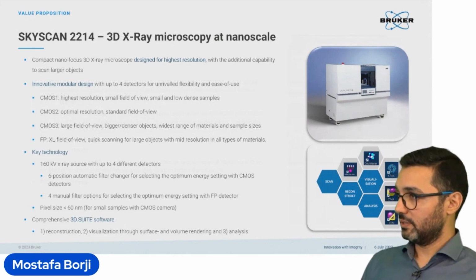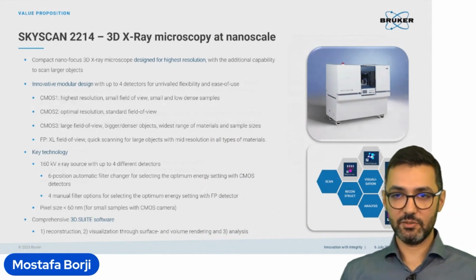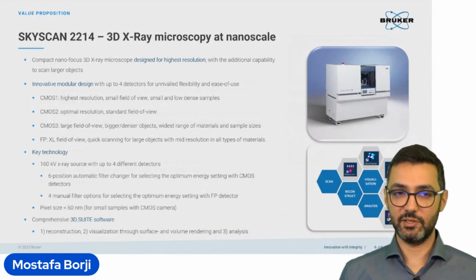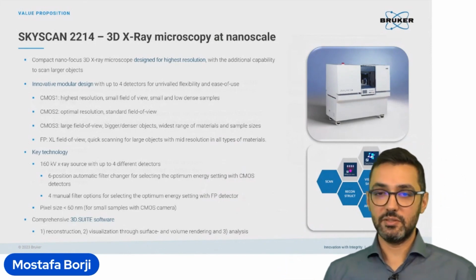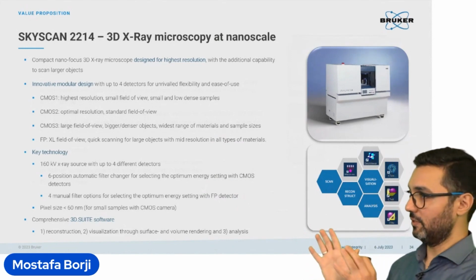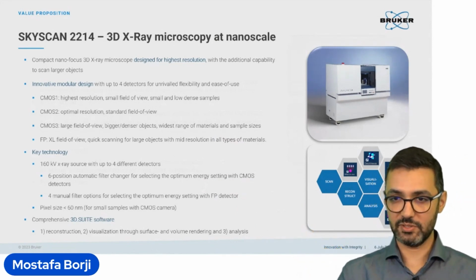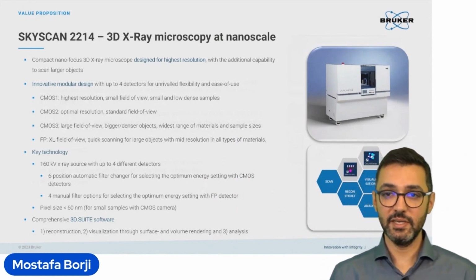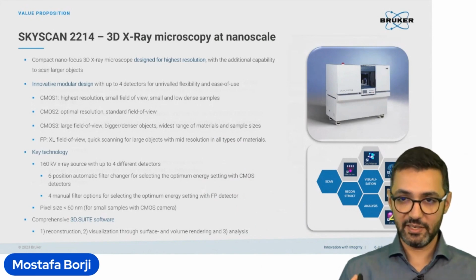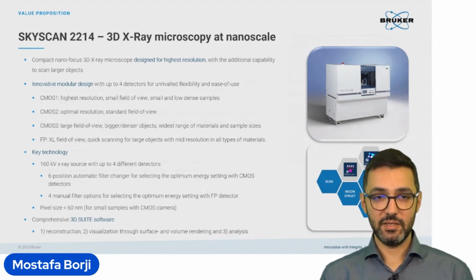So the thing is that not all of these cameras need to be purchased at the beginning. Depending on the requirement, one can go for only 1 or 2 cameras. But the important thing is that all the mechanics and everything is already inside the system. So if in the future someone needs other cameras and would like to equip the device with more cameras, it will be just plug and play. The mechanics are there. There will be no downtime. There will be no very major changes in the system. Everything will be ready.